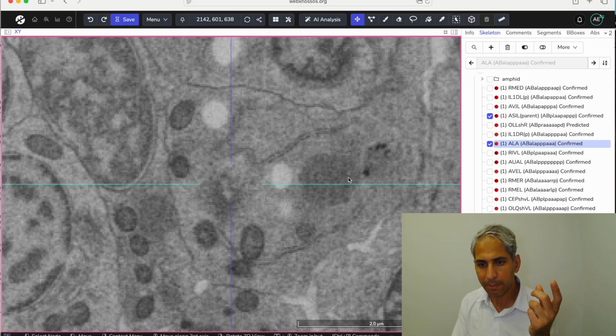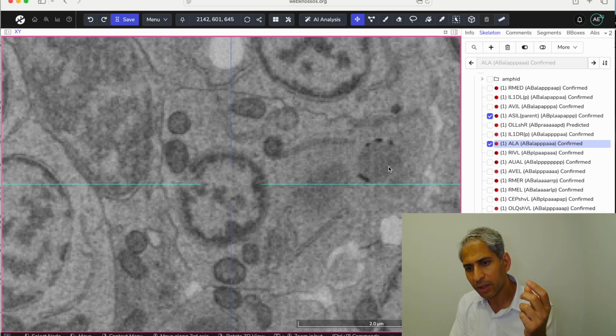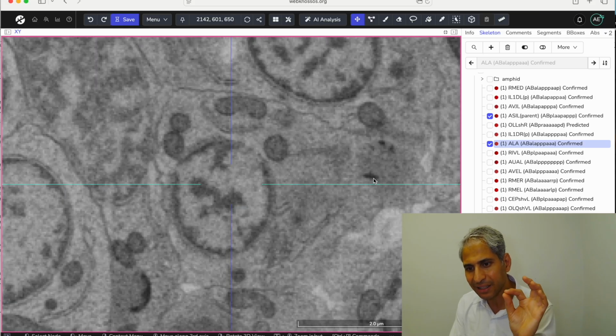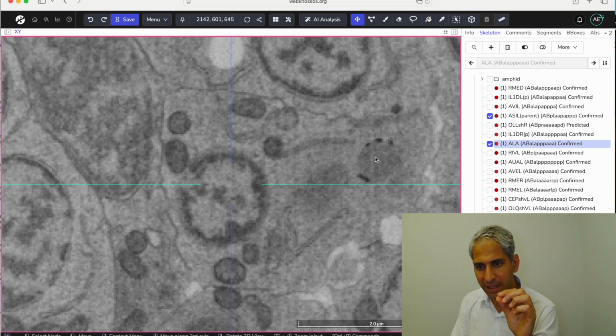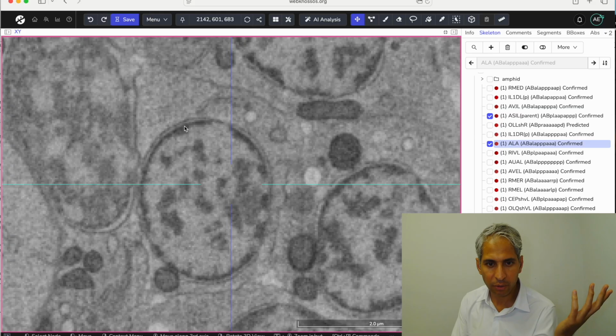And then, what else do we have? Basically these clear droplets. Oh, what's going on here? Look at this. This is some kind of, I don't know if there's a membrane, I don't think there's a membrane here. It looks like a biocondensate, but it has compartments, very dark and then gray. I'm going to stay away from that this week. This does not look like a mitochondria. What's left? This, that. They look like mitochondria.